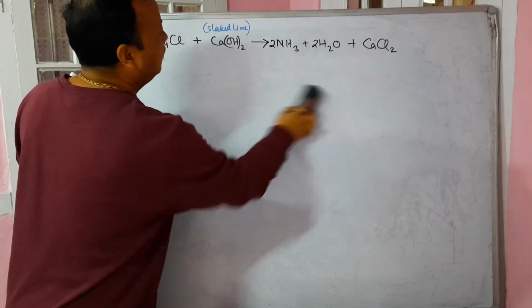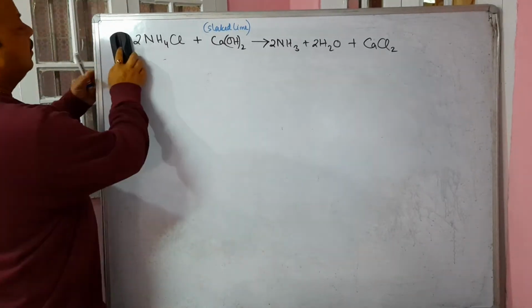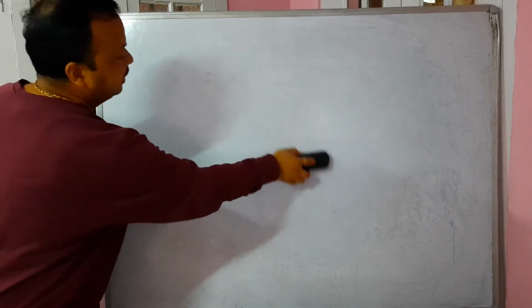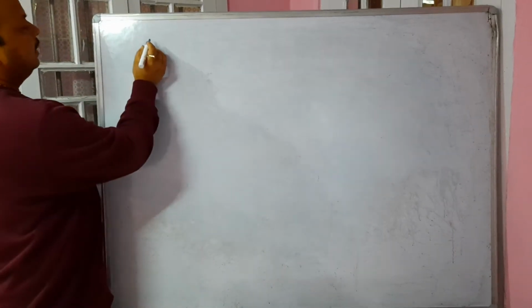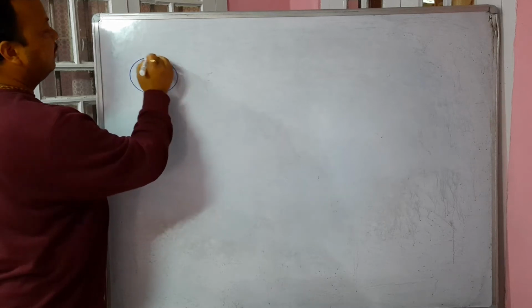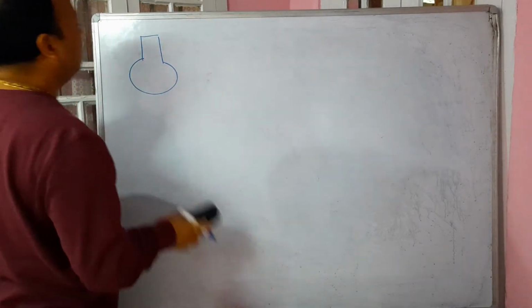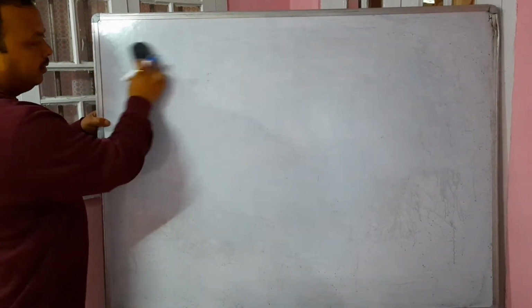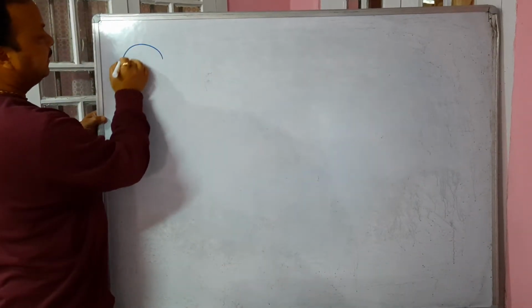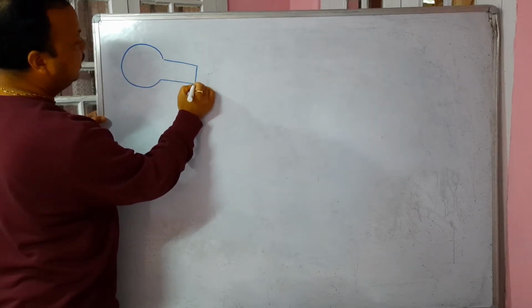Now, let us look at the reaction for the laboratory preparation. First of all, you have to go for a round bottom flask. We can take the round bottom flask in this direction also, but we will not take the flask in this position or layout. We will place it slightly tilted. So this is how your flask will be tilted.